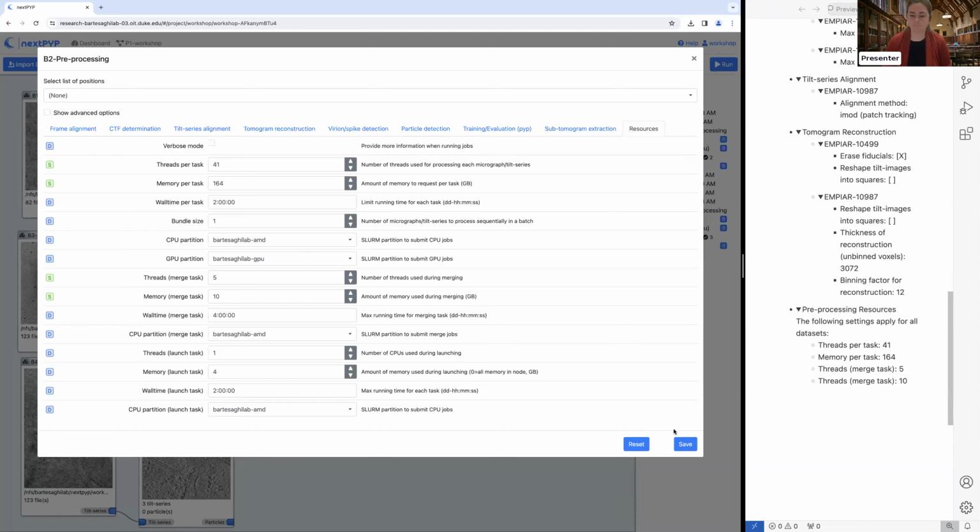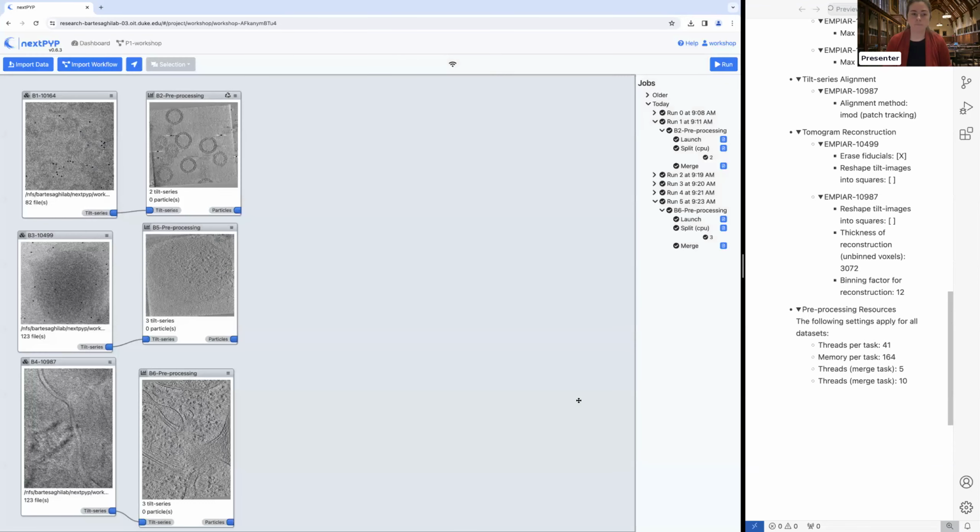Great. There's this one question about excluding tilts. It says once you exclude the tilts, you need to rerun the block in order for that to take effect, and that's a question. Yes.